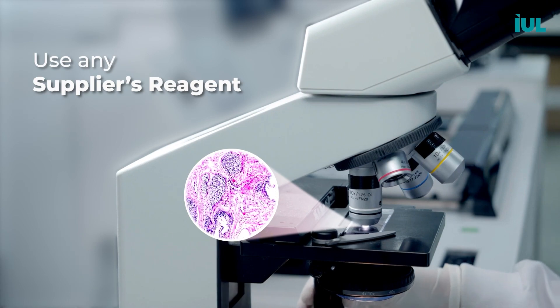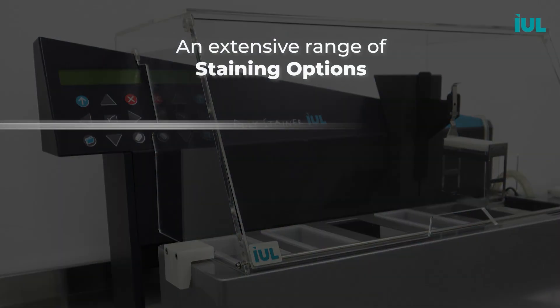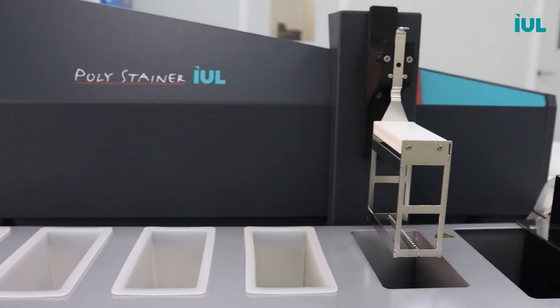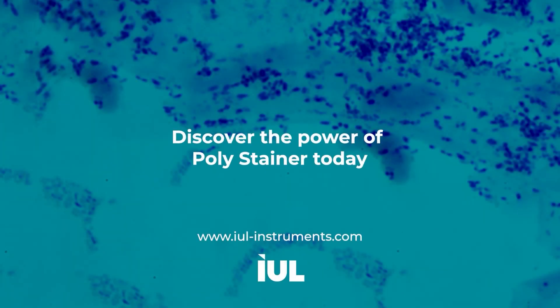Enjoy the freedom to use any supplier's reagents — the Polystainer is an open system platform that allows you to adapt it to your specific staining protocols. With four reagent containers, the Polystainer offers an extensive range of staining options, accommodating even the most complex staining requirements. Discover the power of the Polystainer and unlock a new level of convenience and efficiency in your laboratory staining procedures. Contact us today to learn more.